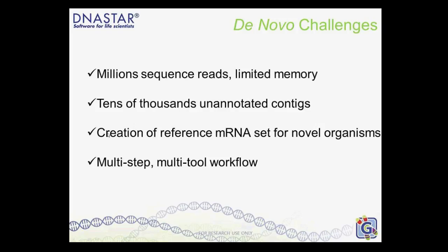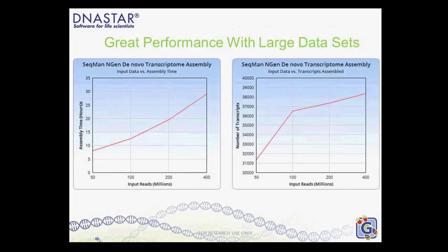The key point is this third step is actually assigning annotations to those contigs that can then be used for RNA-Seq. And rather than just having contig names 1, 2, 3, 4, we're going to have some idea of what that gene is and get an identity to that gene. And so that's really the key, is crunching through all the numbers, getting an annotation, and then using it in the RNA-Seq.